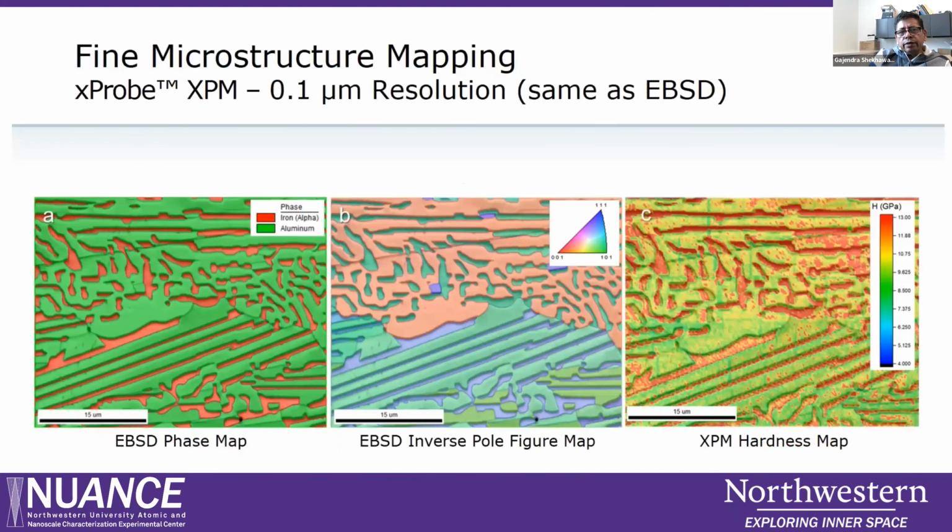And then if you look at this, there is a plan that we integrate the existing one we have, the XPM, accelerated property mapping, with the XProbe also. So this is a MEMS-based probe, which allows us to go to a very low load. You can go down to like 1 or 2 nanonewtons. So basically you can start indenting or mapping pretty thin films, like a few nanometers.